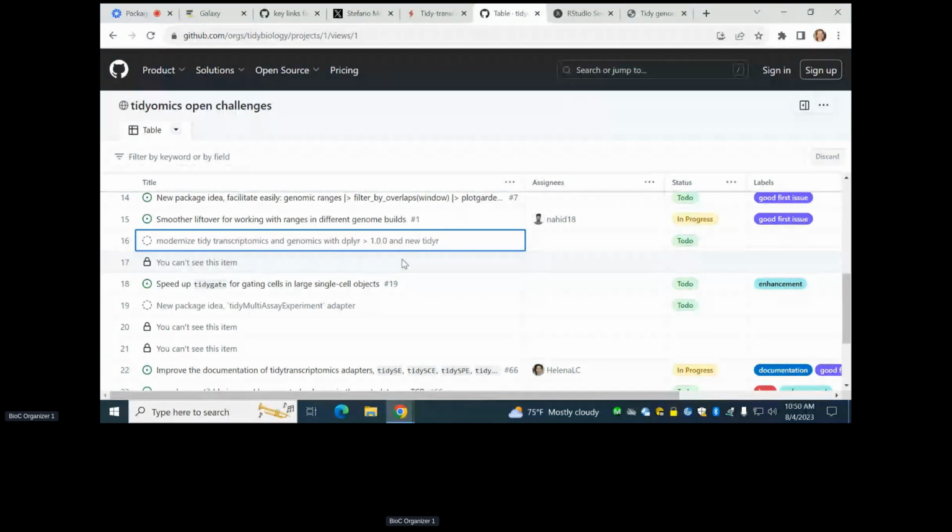Yeah, so maybe any questions? Yeah, so that's a very elegant tool, and I really appreciate your work. I have a question. For all these pipe operators, are they multi-threaded? Because I used the tidyverse before, and I have a really big database, and it turns out that it takes a lot of time to wait on a function. So I wonder if you do some kind of optimization for these pipe tools.